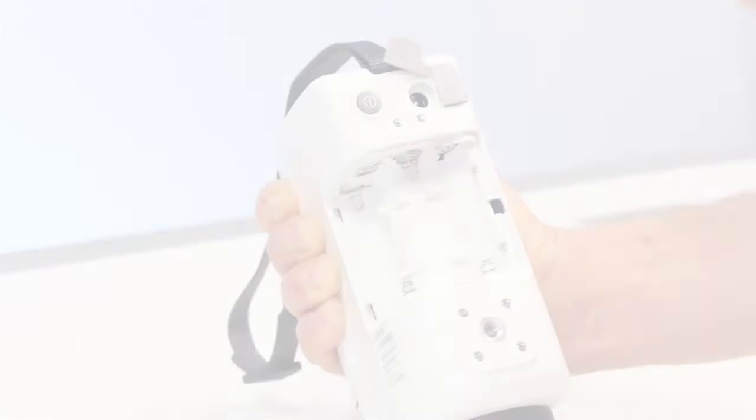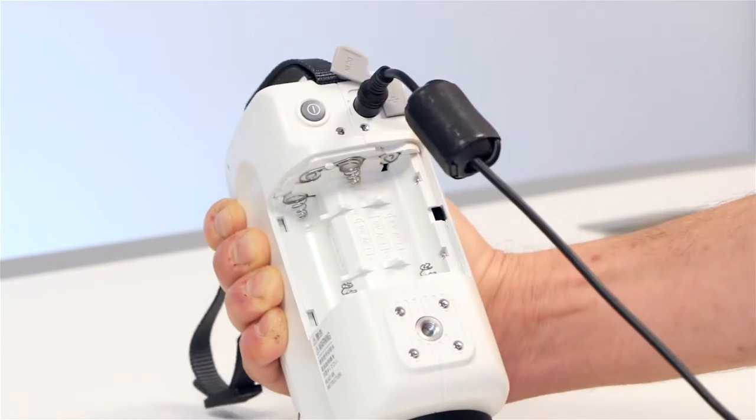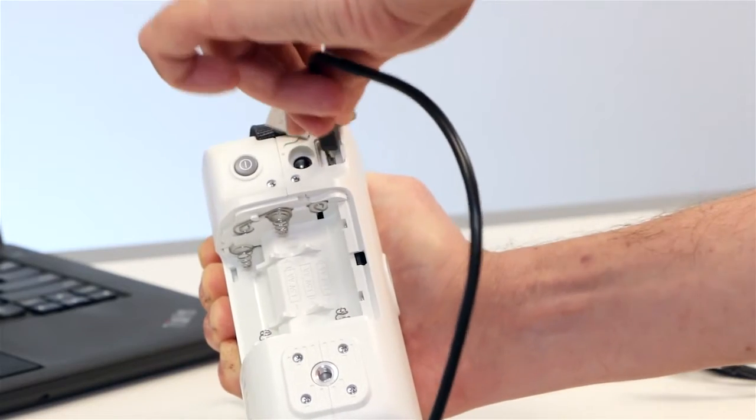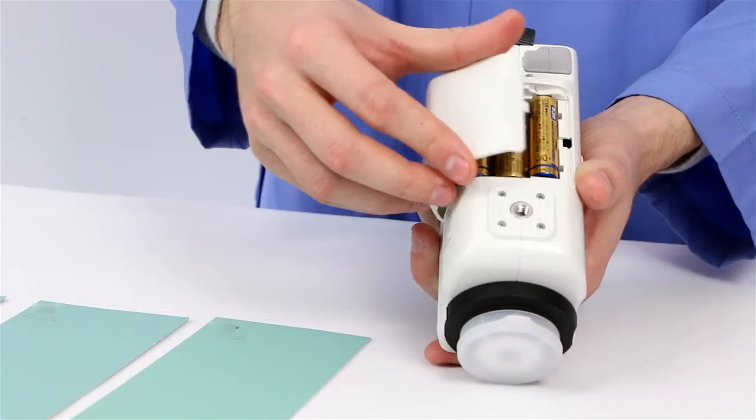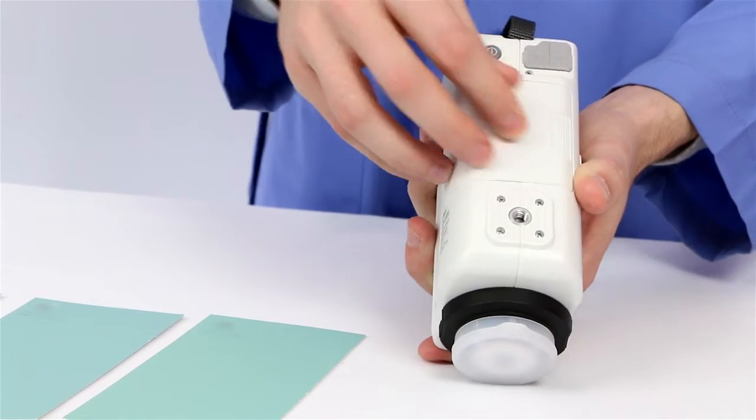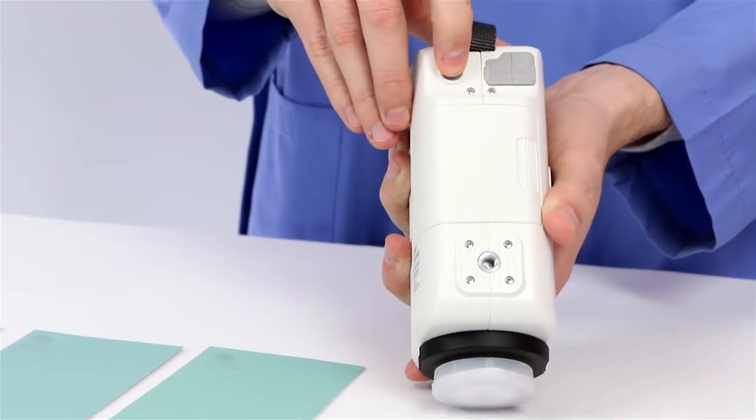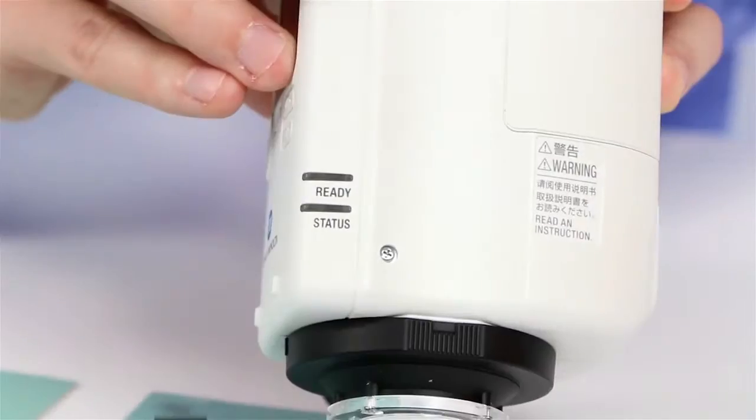You can operate the CR10 Plus with any one of three power sources including an AC adapter, USB cable or batteries. Ergonomic and lightweight design allows you to measure color difference with ease.